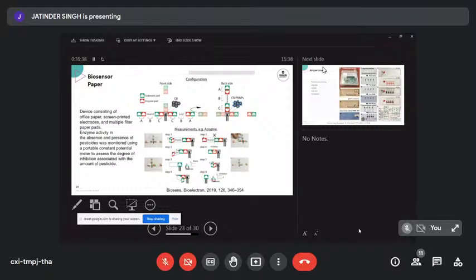Having the substrate and the enzyme bed sitting next to each other, they could deposit the reagents, fold this over and do an electrochemical assay. They did this to do a couple of inhibition assays, I think with pesticides. They could measure the inhibition of the conversion of the substrate by the enzyme electrochemically on top of carbon black electrodes, sometimes functionalized with nanoparticles, sometimes not, to measure atrazine and others.